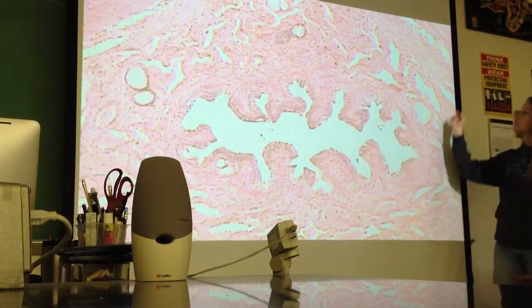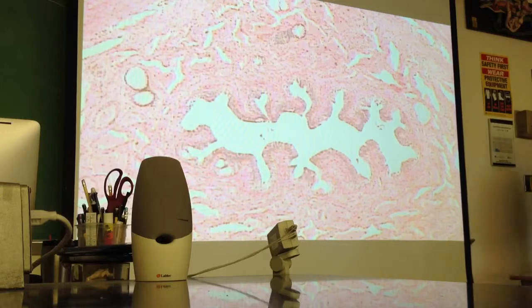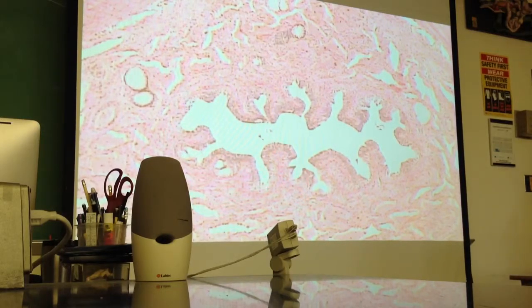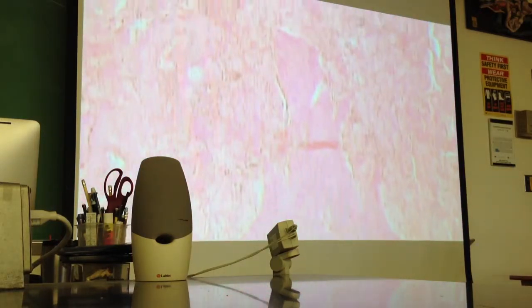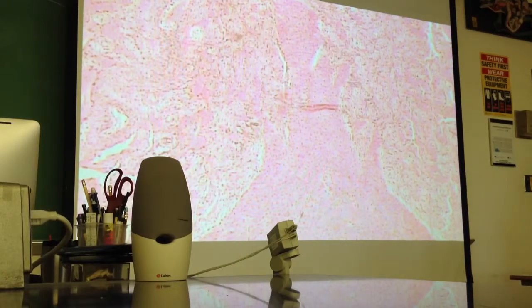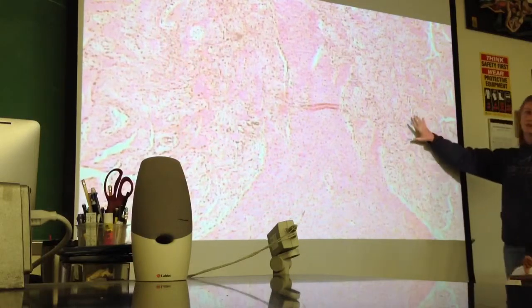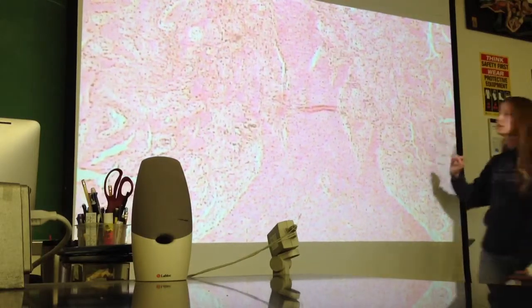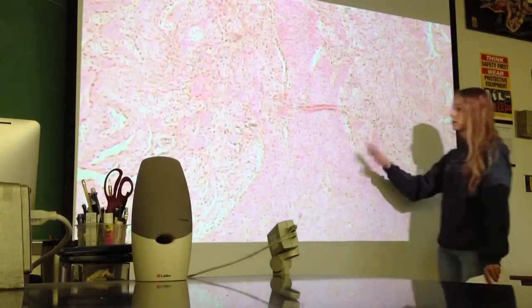All right, so what I have on the board right now showing is the urethra, so that's this lumen right here, which means that all of the muscle that we see around it is going to be the corpus spongiosum. Okay? And then I think on this one we pan up, but it's always flipped, so yeah, we pan up. This darker pink stained dividing line right here is the dividing line between the two corpus cavernosum. So we have a corpus cavernosum right here and a corpus cavernosum on this side. And I'll pan around just one of them in a second.